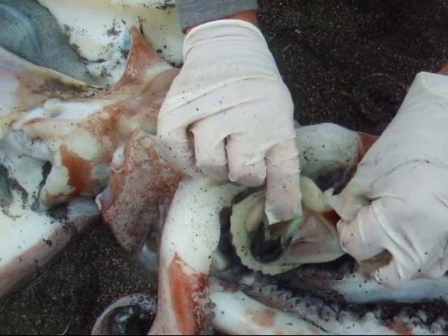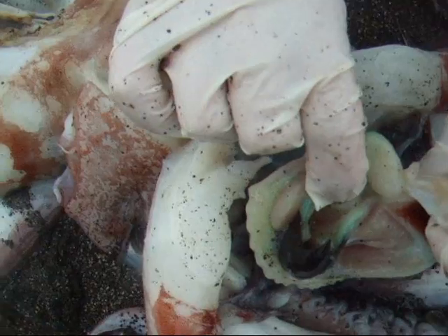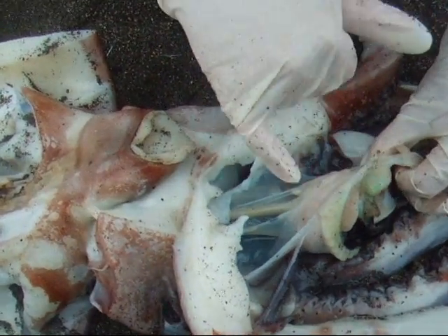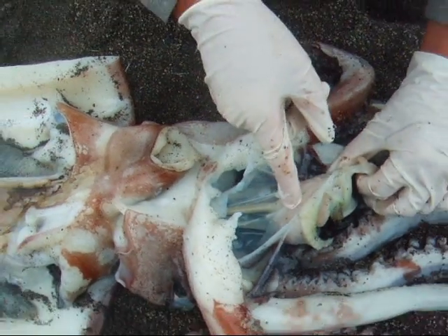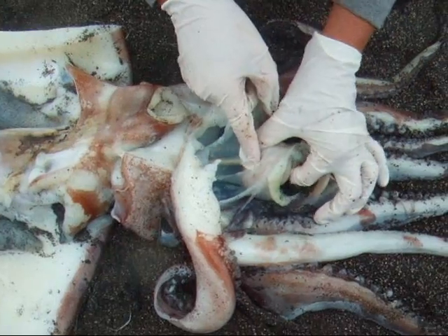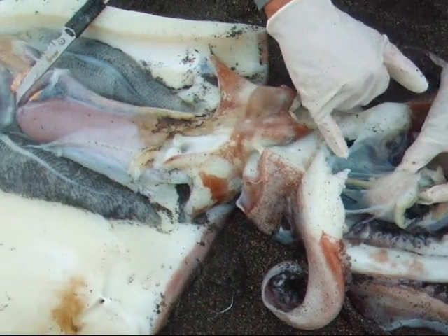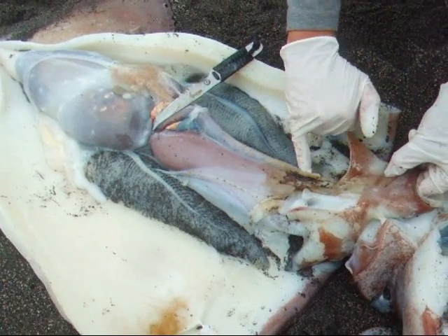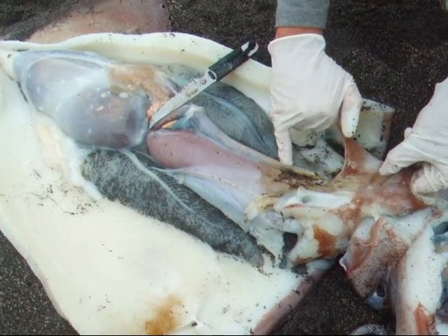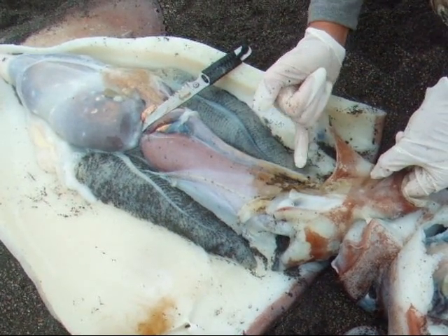Inside, this is the mouth, and that leads into this tube right here, which would be the esophagus. Food enters the mouth, leads into the esophagus, and travels through this digestive tube that sits next to this other tube that we've already spoken about.